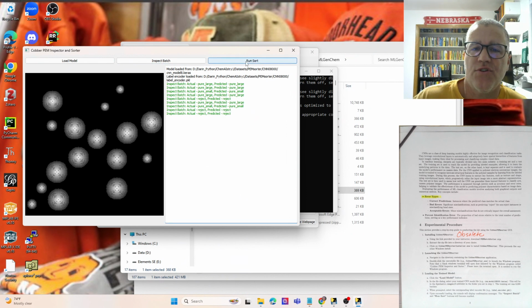So let's go ahead and run the sort. This will run. Again, if you're just coming here and you didn't do the installation, there could be an issue here. If you hit this and the program just crashes, that's likely because it is trying to write some directories and then files. So it's going to sort each of these images, and if it doesn't have permission to write those, then the program will crash. So you can go back to the first video, and see what the troubleshooting workaround is for that.